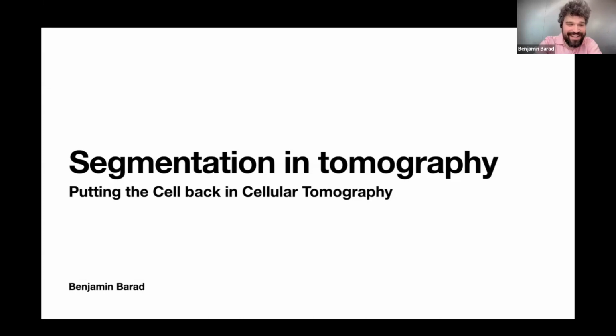This is my second time participating in this course, and it was really fun last year. I gave sort of a short talk, and at the time we had just gotten really excited about doing filament segmentation. So I actually went through doing that live, which was maybe a bold move. Last time it went pretty well, and it was a lot of fun. The video of that's online, so I'm going to give a talk today.